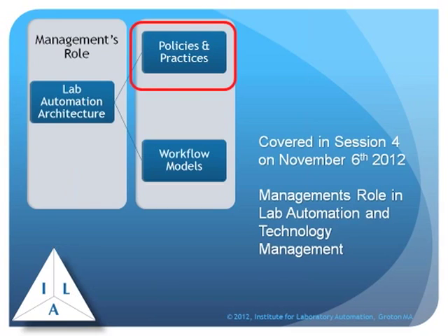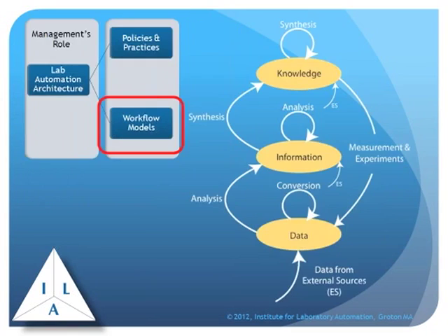There we'll be talking about management's role in lab automation technology management. The next thing we want to look at is workflow models to help illustrate how these systems are working together. And this is the basic model that we use in our work. It might describe one individual or it might describe a group.